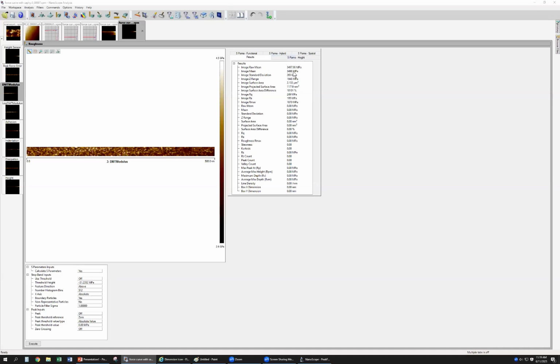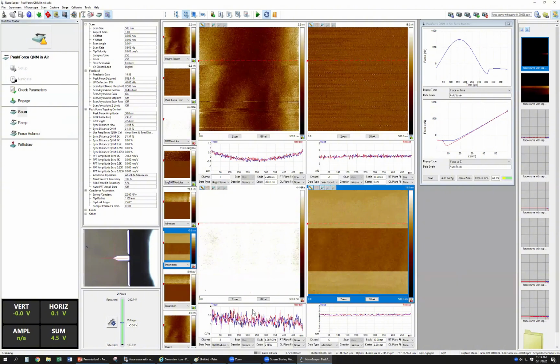The standard value is 2.7. We should adjust more like this one to get to the 2.7. Okay. So but for this one is already too high. Okay. 2.7 almost, right? Almost. Okay. So after you change the parameter, you should collect the image again. Collect the image again. So no need to collect the full image. Just can get every age in.